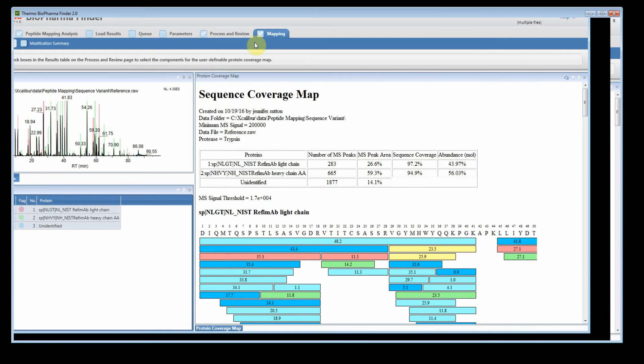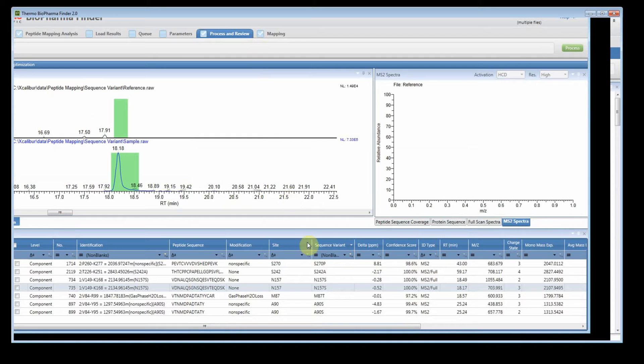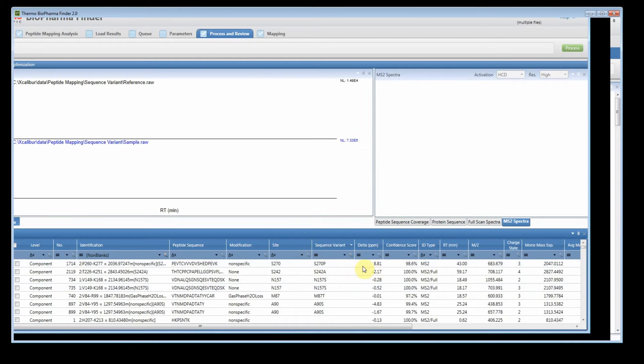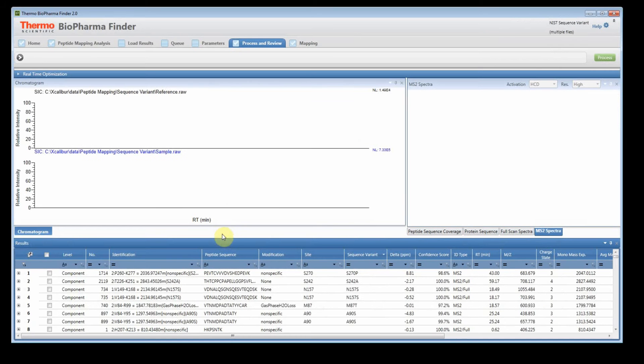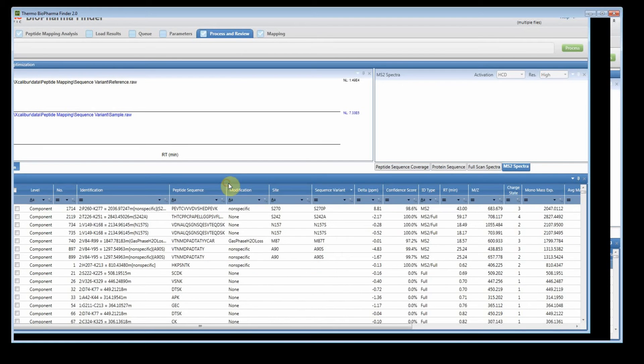However, let's say, if we go back, that you're interested in knowing what would the coverage map look like if I looked at all of the non-modified peptides. So if I exclude all the modifications, for example. So we could say that this has to be equal to none.